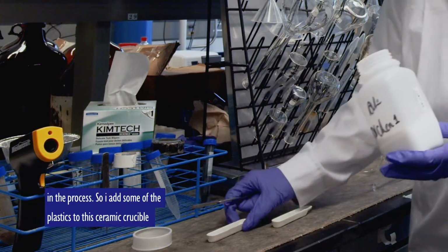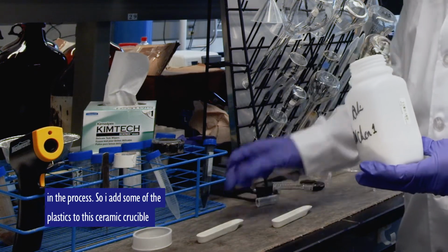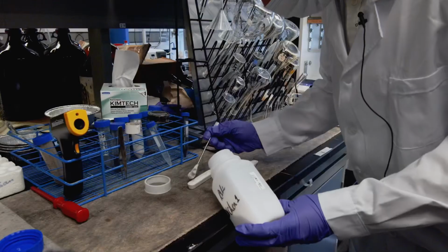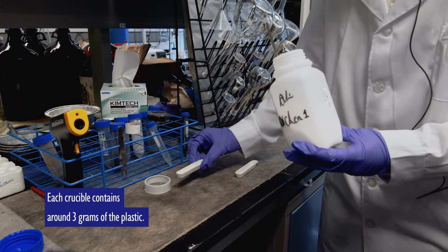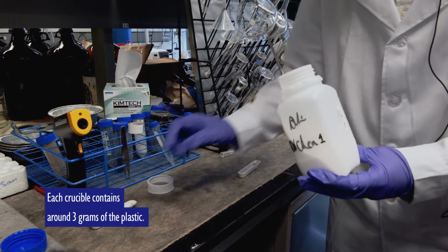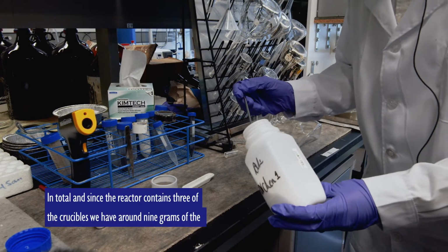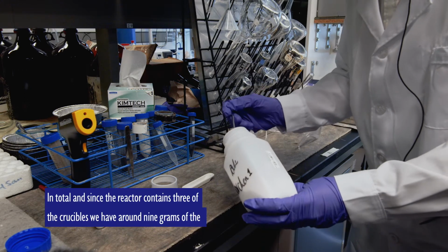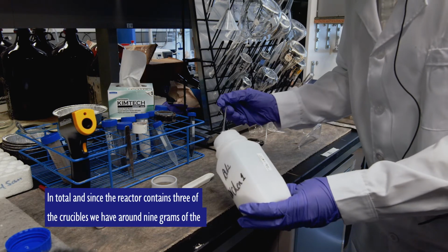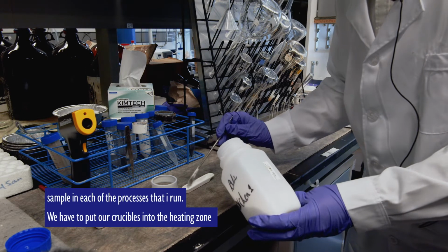So I just add some of the plastics to these ceramic crucibles. Each crucible contains around 3 grams of the plastic. So in total, since the reactor contains three of the crucibles, we have around 9 grams of the sample in each of the processes that I run.